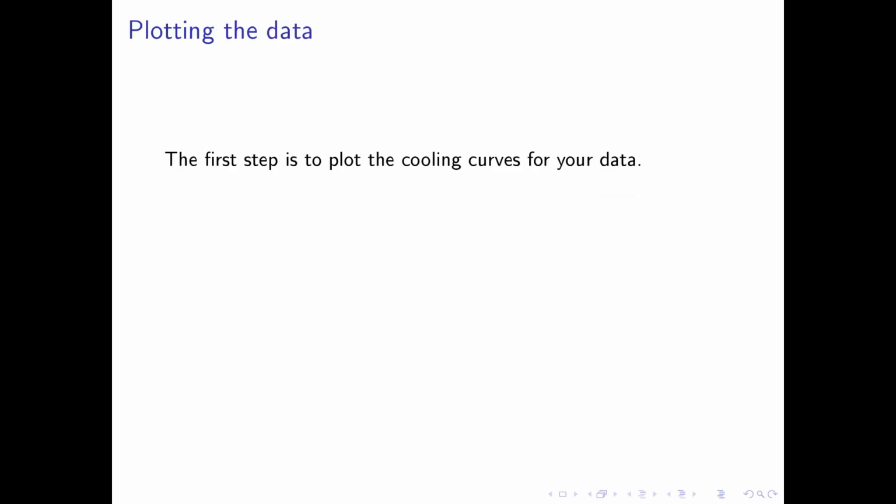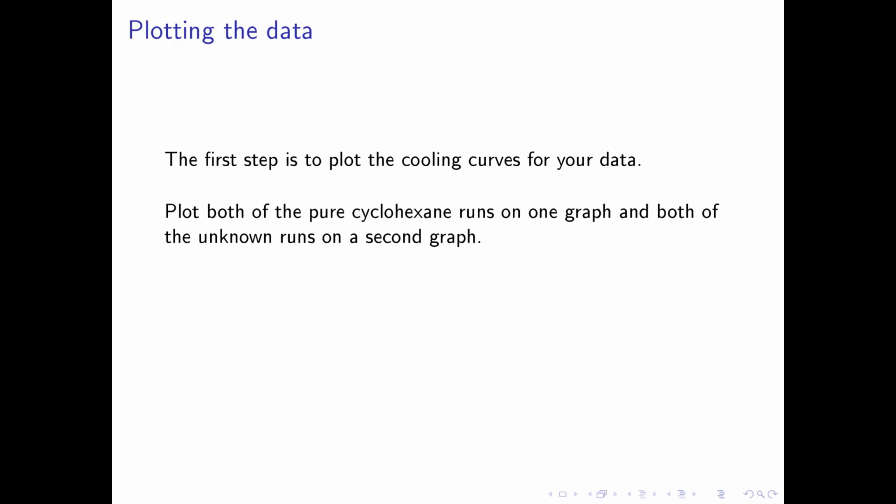The first step is to plot the cooling curves for your data. Please pay special attention to these next few slides to ensure that you perform this correctly. Plot both of the pure cyclohexane runs on one graph and both of the unknown runs on a second graph.